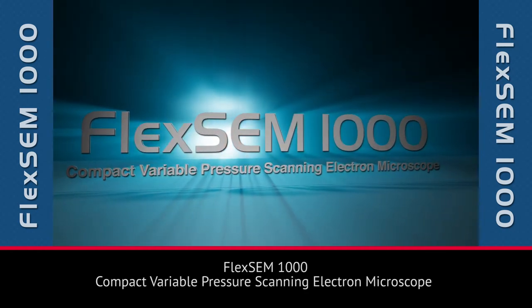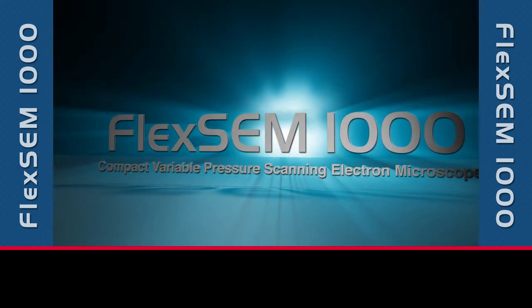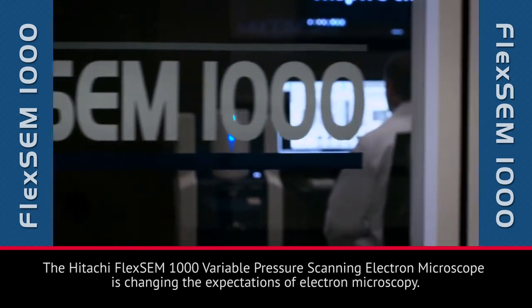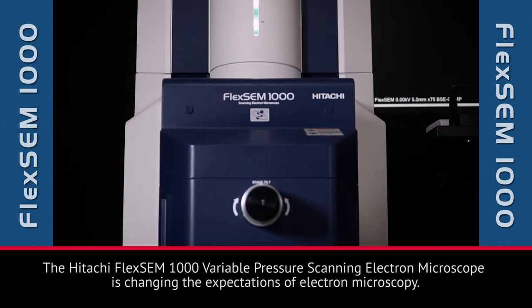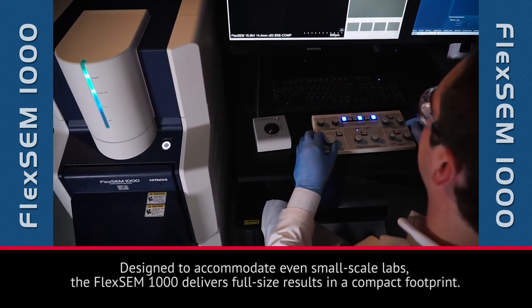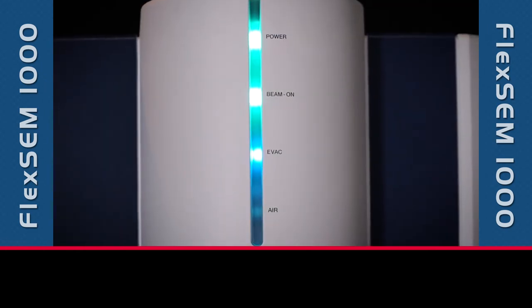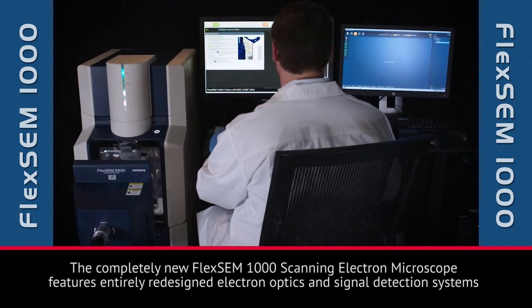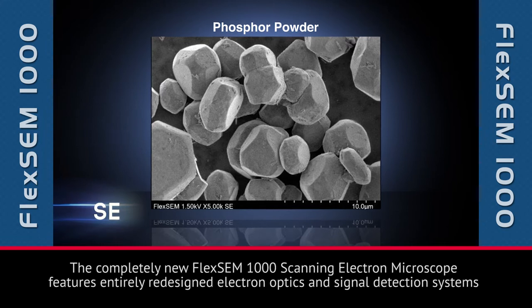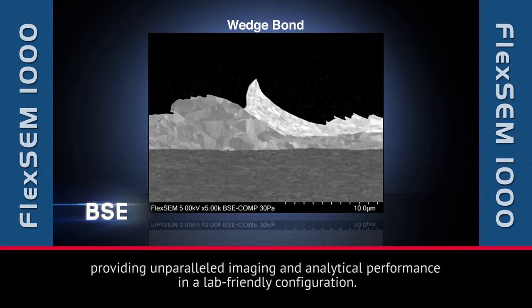The Hitachi FlexSEM 1000 Variable Pressure Scanning Electron Microscope is changing the expectations of electron microscopy. Designed to accommodate even small-scale labs, the FlexSEM 1000 delivers full-size results in a compact footprint. The completely new FlexSEM 1000 features entirely redesigned electron optics and signal detection systems, providing unparalleled imaging and analytical performance in a lab-friendly configuration.